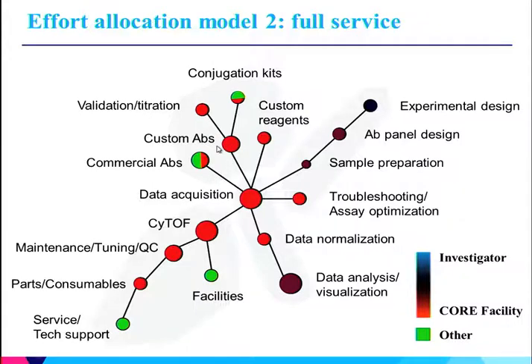So our strategy was that we actually developed our own in-house repositories of many of the antibodies we thought would be useful and could then allow investigators to use them on a per test basis. So now by essentially paying $3.50 or $4 for one use of that antibody, you're only spending $250 on that experiment instead of $10,000. So this was a first really important step to be able to facilitate access.